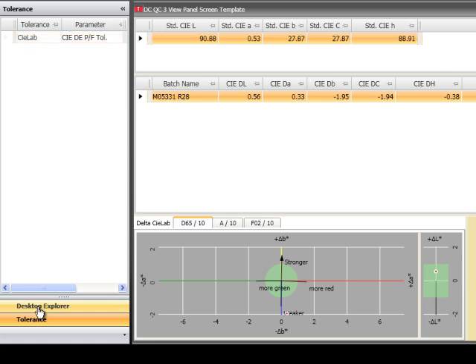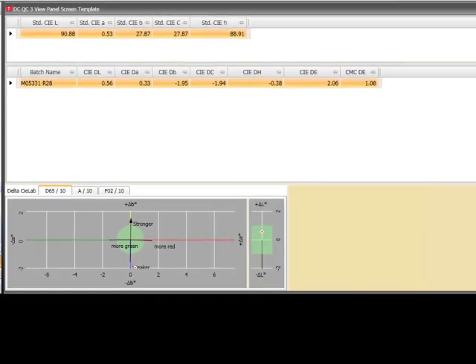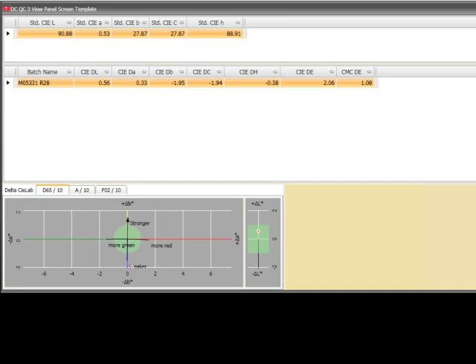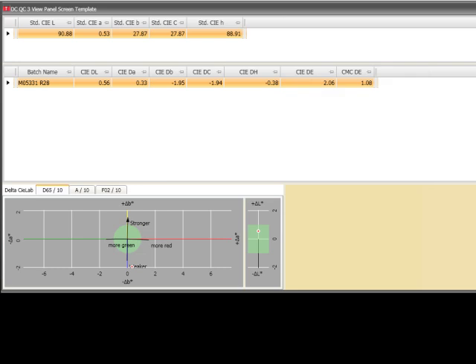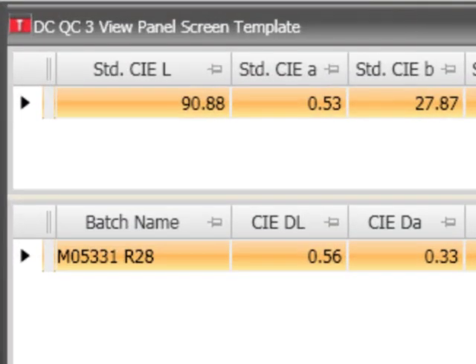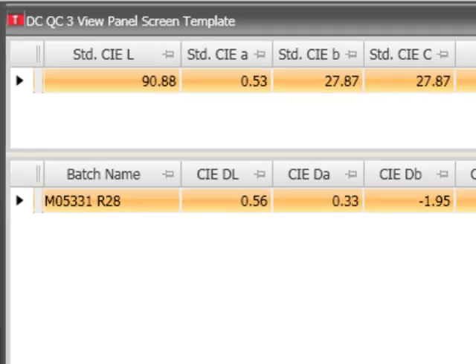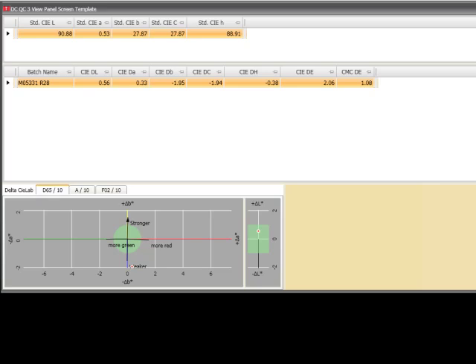The final area takes up the rest of the screen for the program. This area is used to display templates and or legacy forms. Forms were used in previous versions of tools and are allowed to be used in the new version. Templates are preset panes, like window panes, that are a change in the way data is presented and will be the focus of this video. The software comes with three templates already created. In the example, a three-view template is shown.